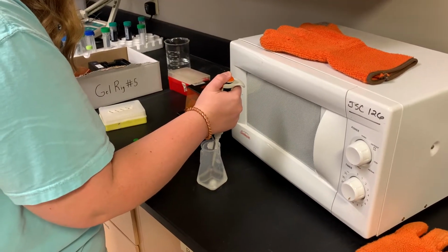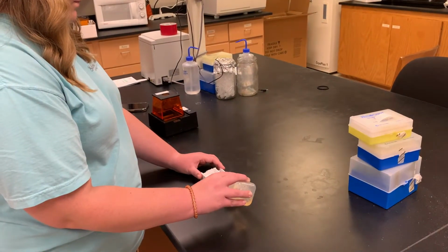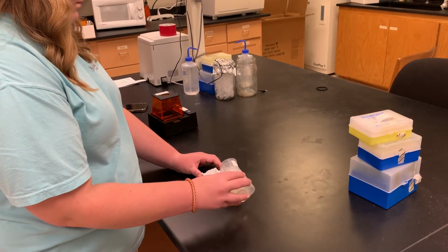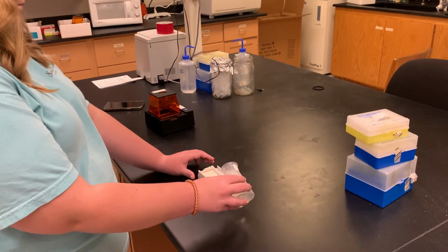Leave the gel to cool for 10 to 15 minutes. Do not pour it while it is still hot. Pour the gel mixture evenly into both halves of the gel mold. Even though this procedure makes 2 gels, you will only use 1.